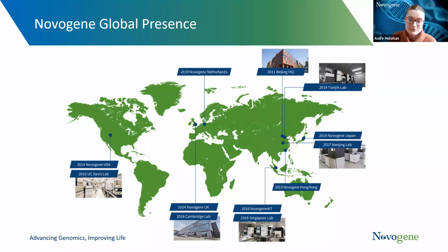However, at our heart, we are a global company. We can offer services across Asia and the US and of course Europe. Falcon 2 has now been deployed across a number of our labs, standardizing our services globally. With almost 2,000 employees and serving over 5,600 customers in world-class universities, biotech companies, and hospitals, we can provide sequencing for the smallest or largest of projects.